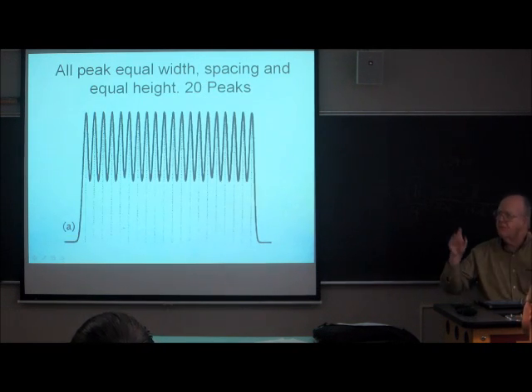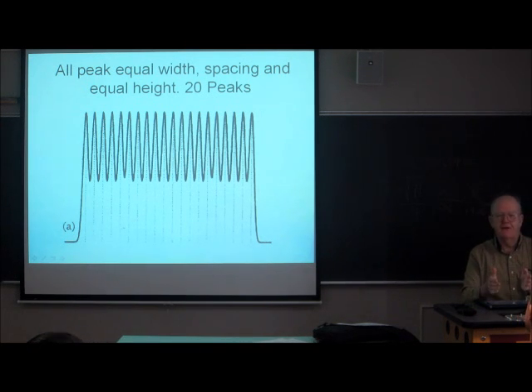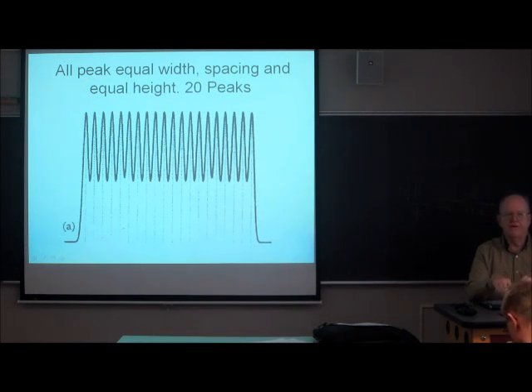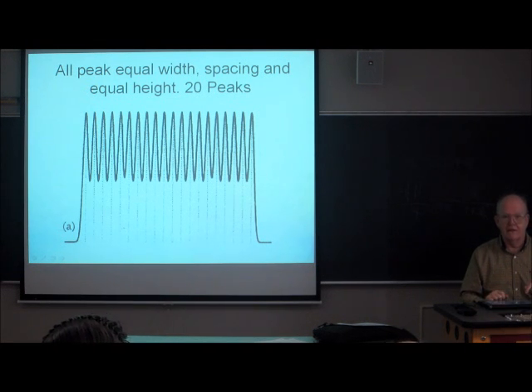And we'll knock off here. But this is the initial situation we're talking about where everybody's lockstep. And we're going to build on this theme, and we're going to let the peak positions be non-uniform. And we're going to see how many peaks we get. And it's going to be a lot less than the peak capacity, a lot less. Okay.